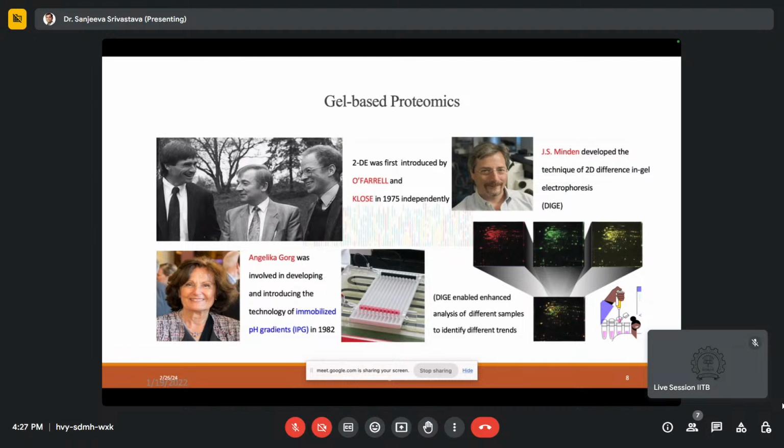So that's something which can be utilized as a benchmark for your qualitative good sample preparation. Sometimes your sample, I started talking about bacterial sample in this case, may not have too much bias, but sometimes if you're looking at serum protein or plasma protein, you will see a lot of abundant proteins, which will be like a big block over there, and then many remaining things will be quite affected because of that, being very low abundant. If you're looking at some sort of plant sample like plant leaf, Rubisco has a very humongous band.